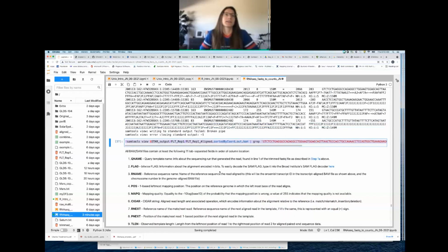Okay, mine finished running, but I don't see an output. Did anybody else get an output? It's done. So MapQ, yeah. A MapQ 255 means that it's uniquely mapped, and because it's uniquely mapped, it doesn't have a mapping quality based on how many places it maps to. I pulled that definition from the document for the SAM file.